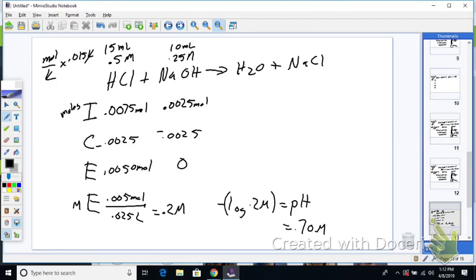You're going to find with a strong acid neutralized with a strong base, there's not very much change until it's neutral. That's why it goes pink to that darker shade, a maroon. It goes pink, and then boom, right away it's a base. So it's a quick transition. And we don't see much of a change in the pH through this whole process until we get really, really close to neutral. Because it'll eventually get to 7, neutral. When will it get to 7? What do we know about these two? We don't even have to do a calculation because we know it's going to be a pH of 7 when they're equal. When these two are equal, that means it's a perfect combination of acid and base, and the color would be pink. Okay? So, questions on that?